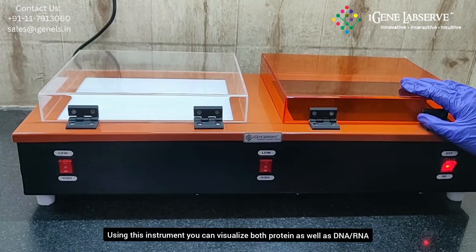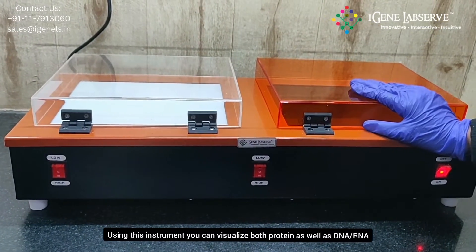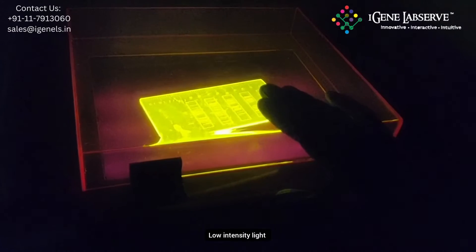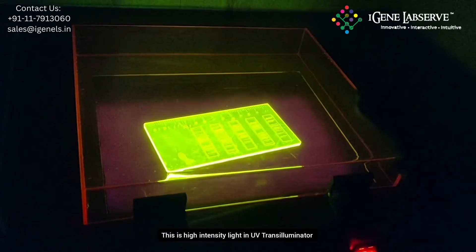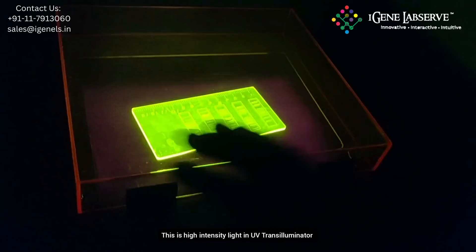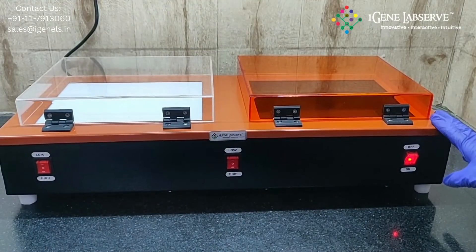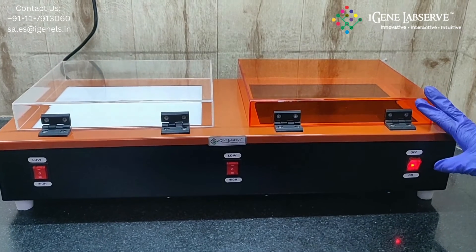Using this instrument you can analyze both protein as well as DNA and RNA gels. This demonstrates the low intensity and high intensity light in the UV transilluminator. This is how iGene's LUVI plus white light transilluminator works.